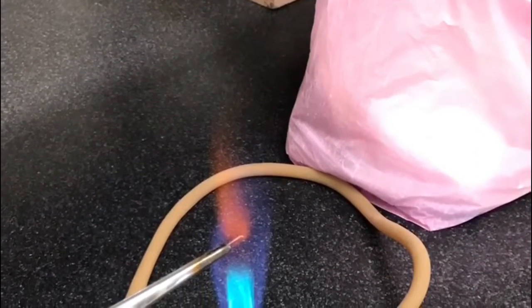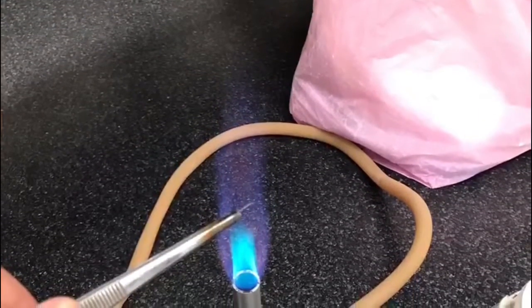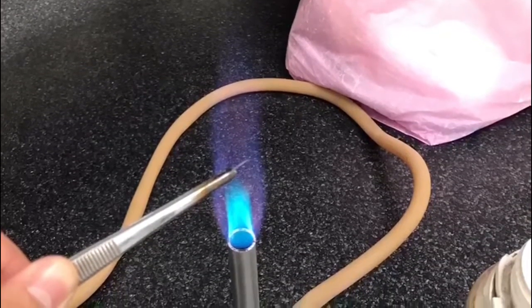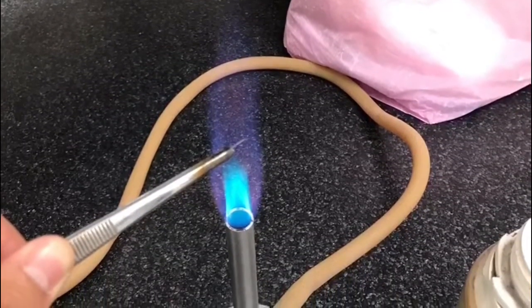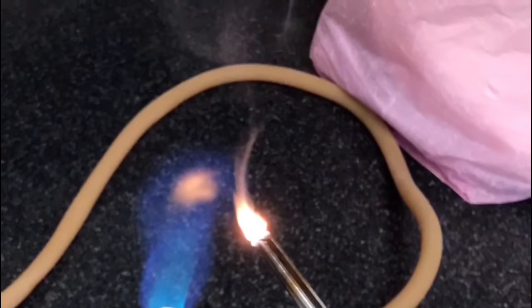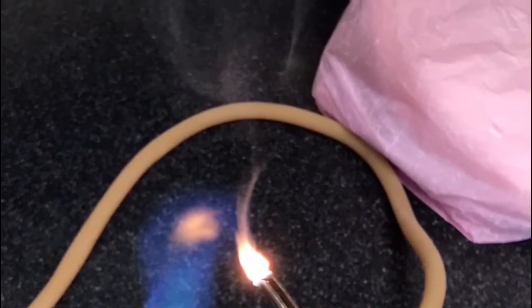When we burned the copper for the rapid oxidation, it quickly burned and lost all color and shine, and it became just ashes. When we burned the aluminum for the rapid oxidation, it quickly burned like it was real paper.